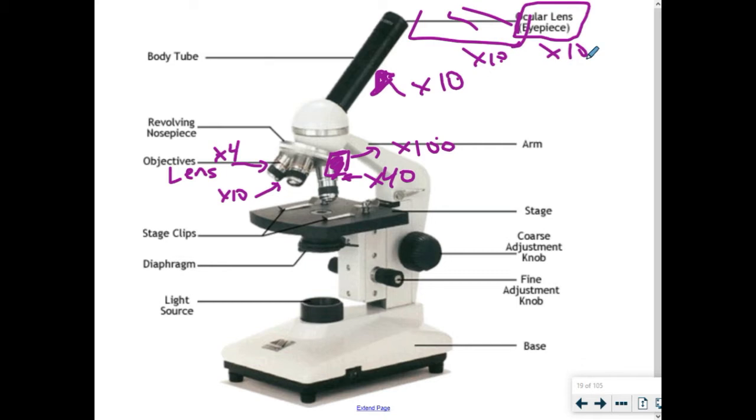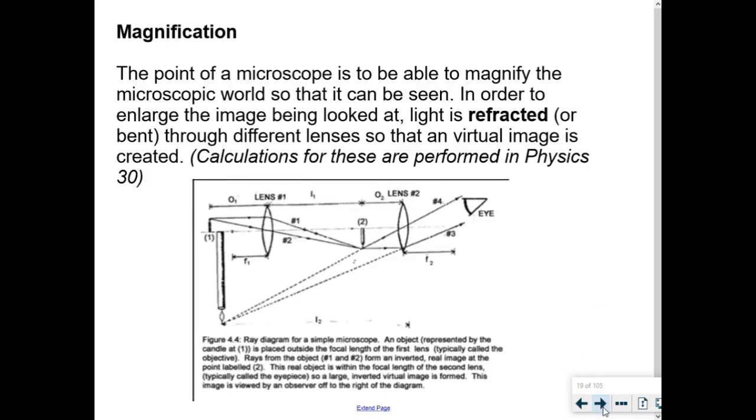And that's the problem, is that we're discussing 2 different things. There's the ability to zoom in, sure, but there's also resolution. If you can zoom in, but you can't actually tell the difference between this and this, if it's just all one big blurry blob, just because you zoom in doesn't mean it's helpful. Okay. And one of the best ways of me describing this is through photos of pixels and stuff like that. So before I get to that, though, let's discuss this term first here, magnification.